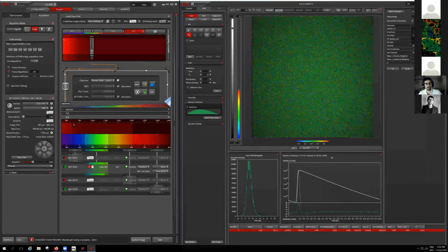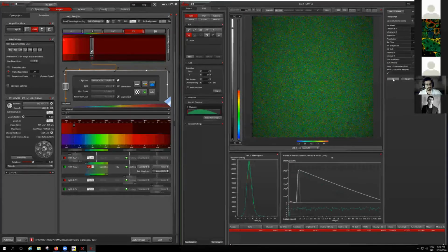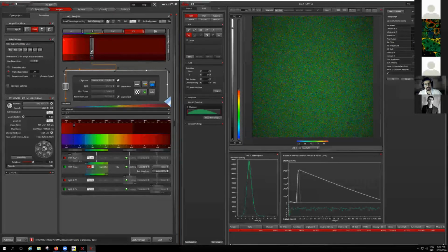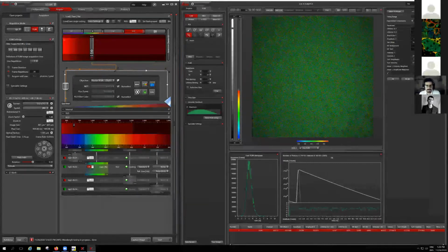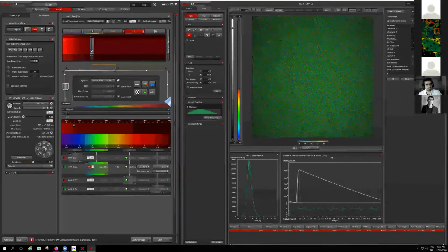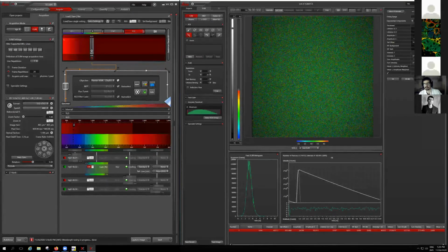If I just go to 2 components, clearly it is better, and I'm getting a short lifetime. On top of that, the value which I'm expecting to see for my sample. So should I accept this one? And also the chi-square is really nice. It's about 1. That's very good. But I have this extremely short lifetime, which I'm not happy with.